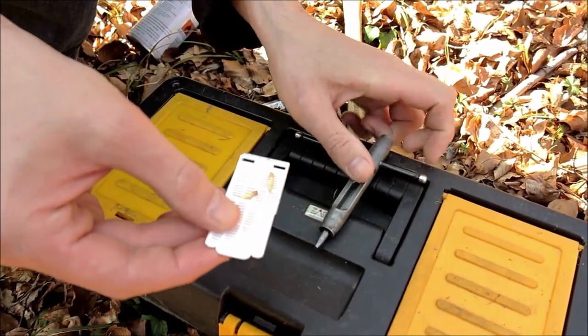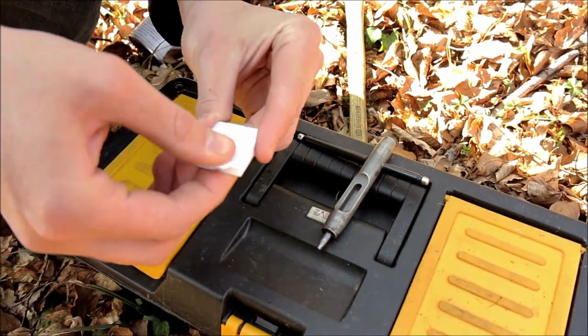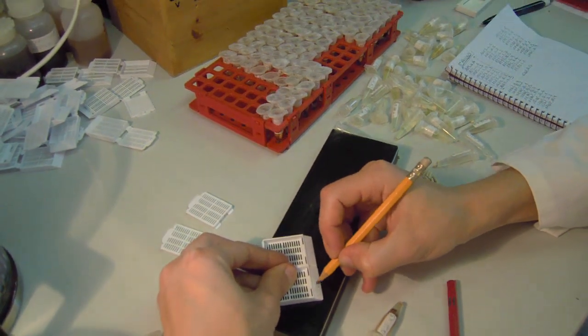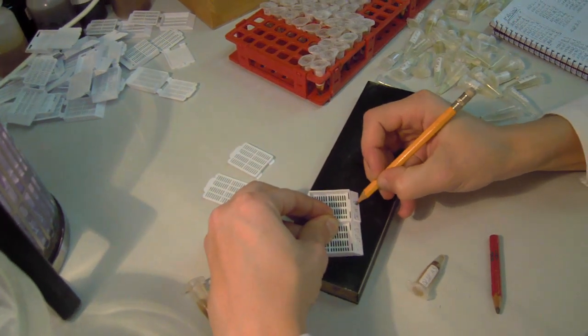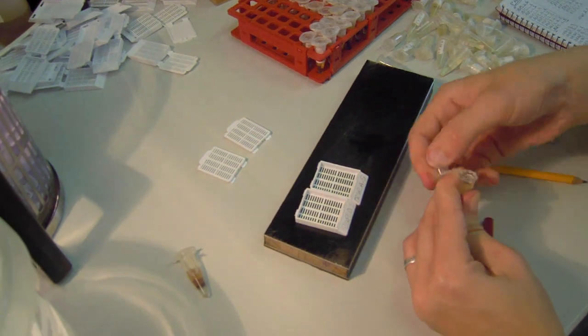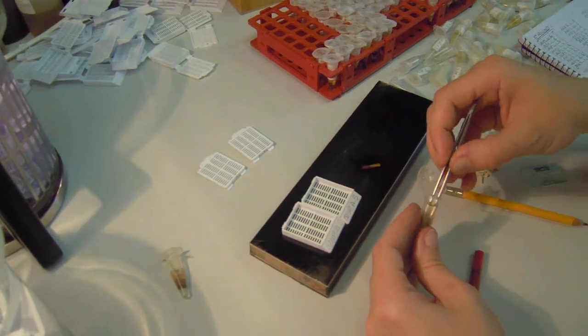The so-called microcores can be placed into Eppendorf tubes or directly into histosets. For further processing, the microcores are transferred from Eppendorf tubes to the histosets, marked with the sample number. Usually we collect two microcores — one sample is archived and the other is prepared for further processing.